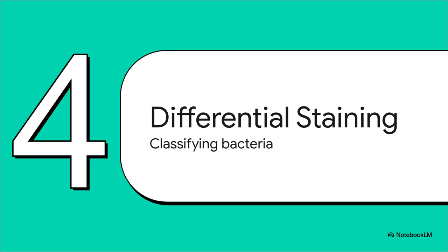But simple staining has its limits. What if you have a mix of different bacteria in your sample and you need to tell them apart? Yeah, simple staining isn't going to cut it. For that, you need to level up to something called differential staining.